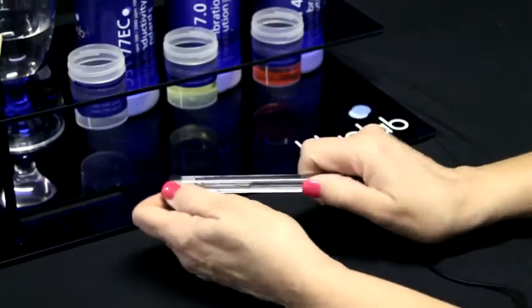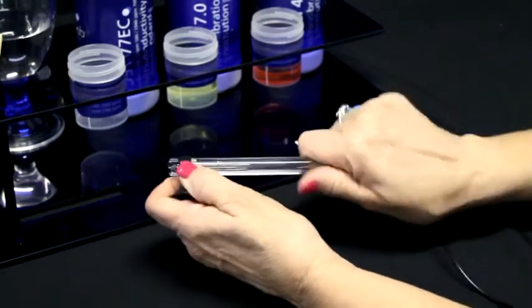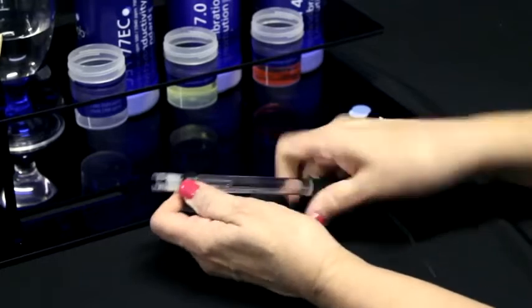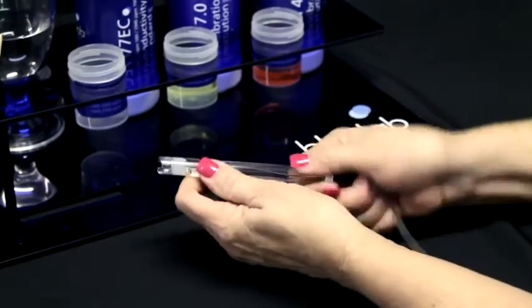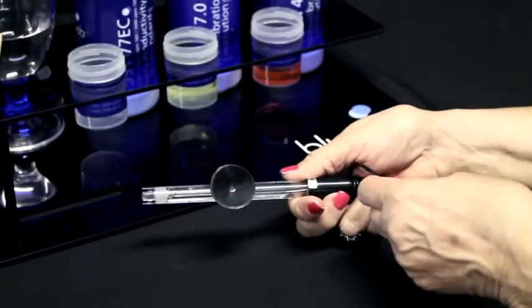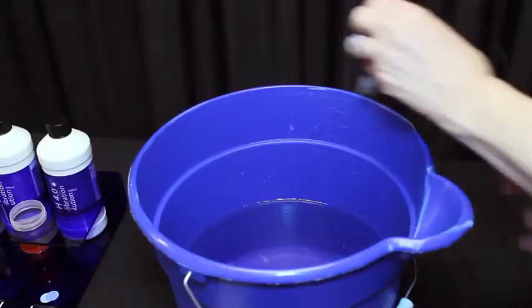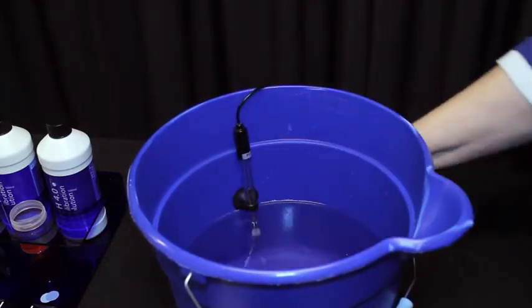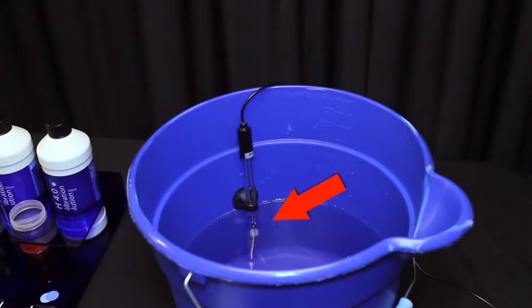The pH probe comes with a suction cup to prevent permanent damage to the glass probe. Remove the pH probe storage cap and gently twist the suction cup onto the stem of the pH probe. To take a measurement, lightly push the suction cup onto the side of the reservoir, far enough down so the pH probe is in the solution. You can also hold the pH probe so the tip is in the solution if you're taking readings from multiple locations. Ensure the probe does not knock or bump anything in the reservoir.